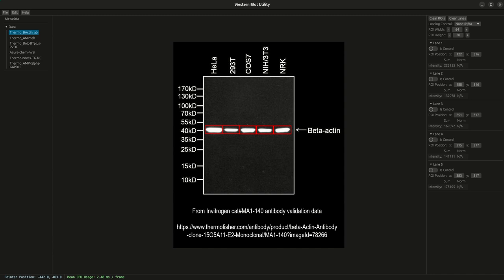In this video, we're going to cover how you do exports in Western Blot Utility. We recognize that the Western Blot Utility is in its infancy, so it doesn't necessarily solve all your needs and isn't a one-stop shop. So to help facilitate you taking the data that last mile to whatever format suits your application, we support export. And exporting is not too complicated.